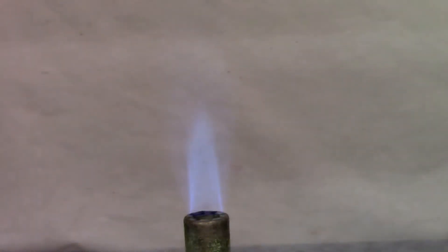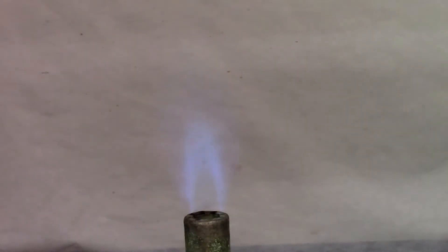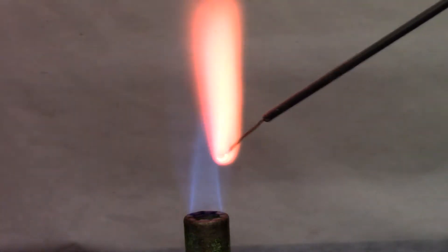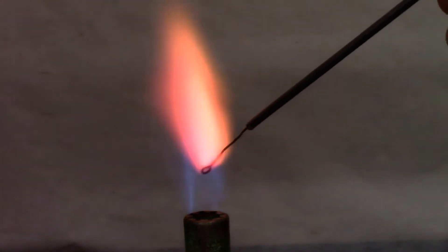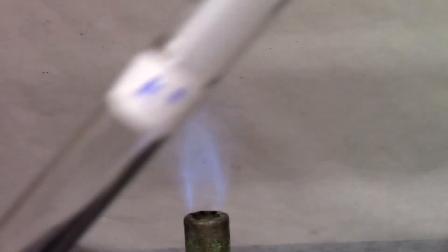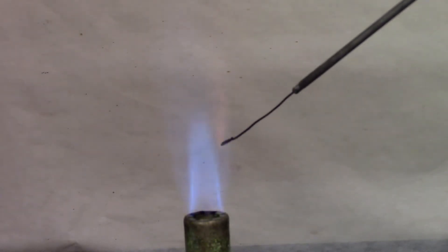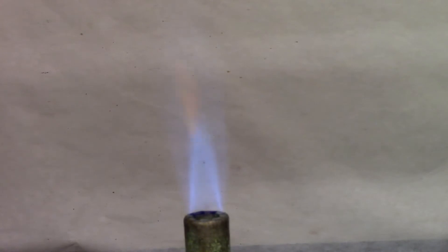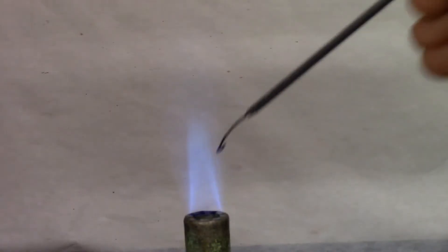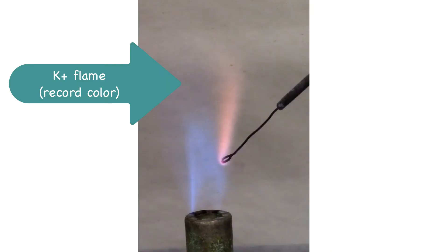Next is lithium solution. Next is potassium solution — it's a very light pink or purple colored flame. Next is sodium solution.